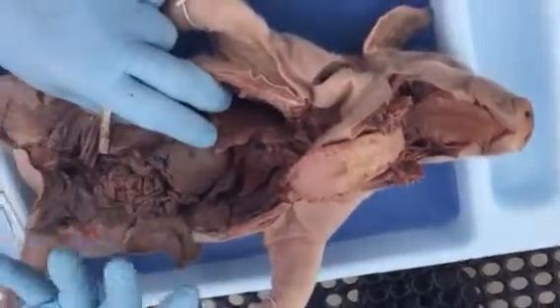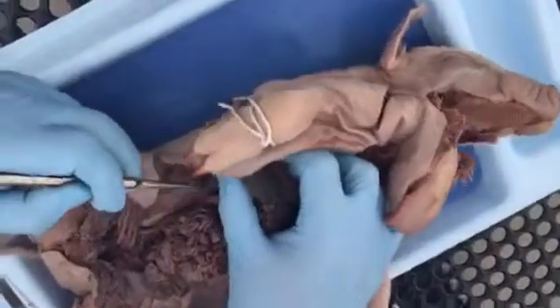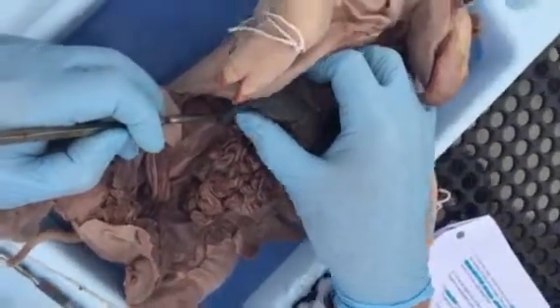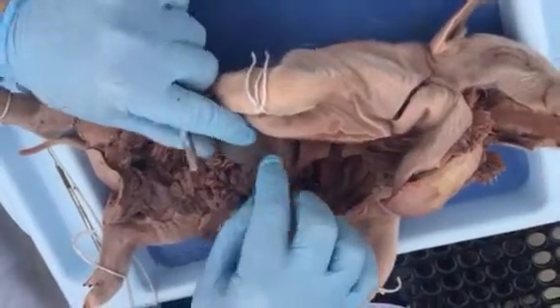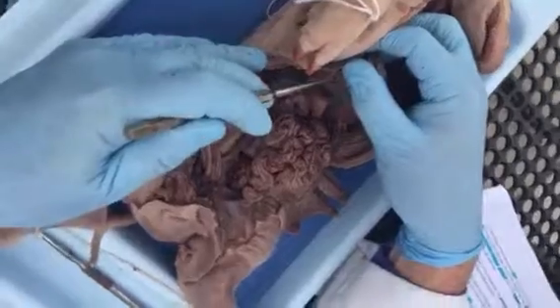Okay? And then, like the lung, there's one lone one. And it's right here. It's called the caudate lobe. So there's only one of those. All right? If I lift the right central lobe, that's where the gallbladder is located. This is the gallbladder here.